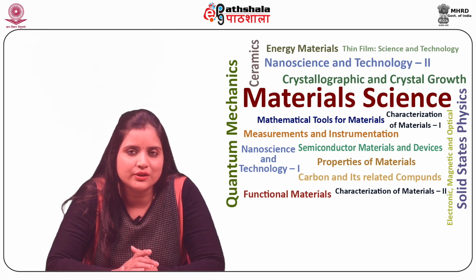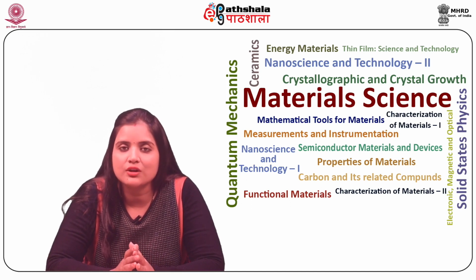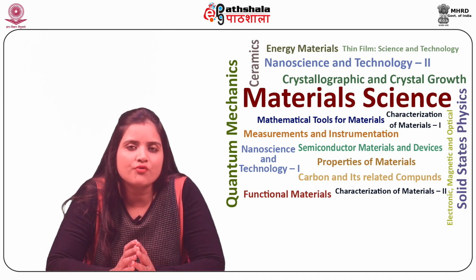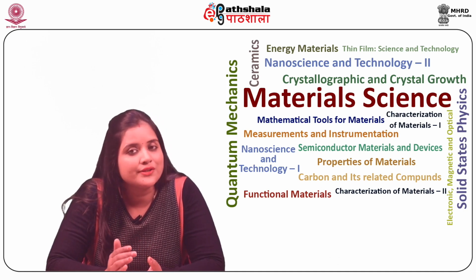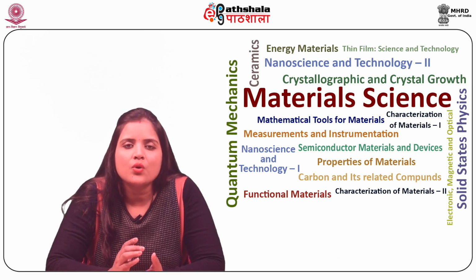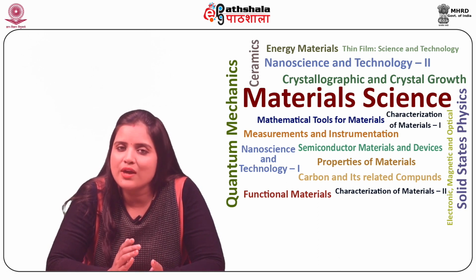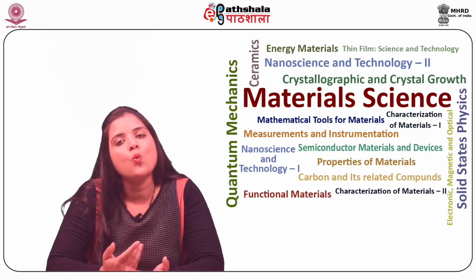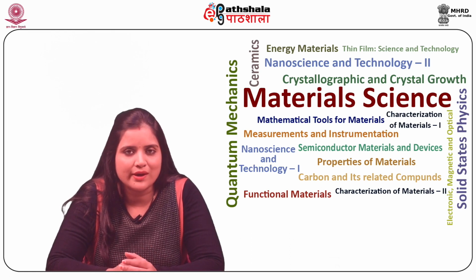That resolution is limited to the dimensions of the detector may also be thought of in terms of signal processing. Assume a sample consisting of co-sinusoidally varying features of spatial frequency alpha, that is, g of x is equal to 1 plus cos of 2 pi alpha x.